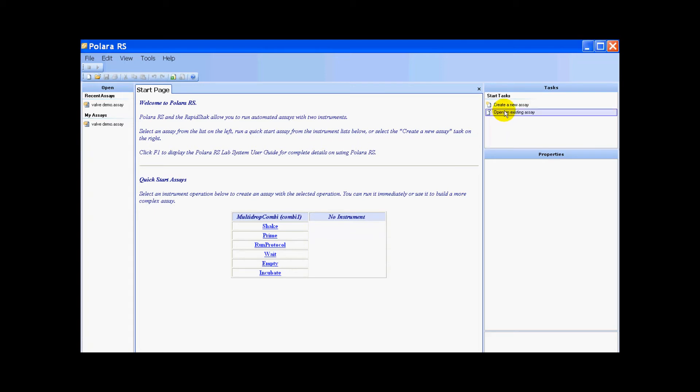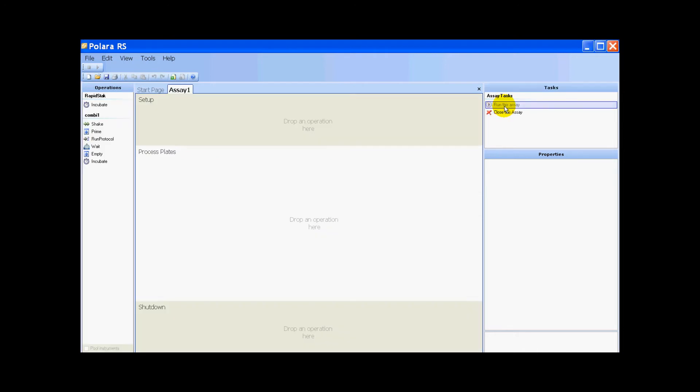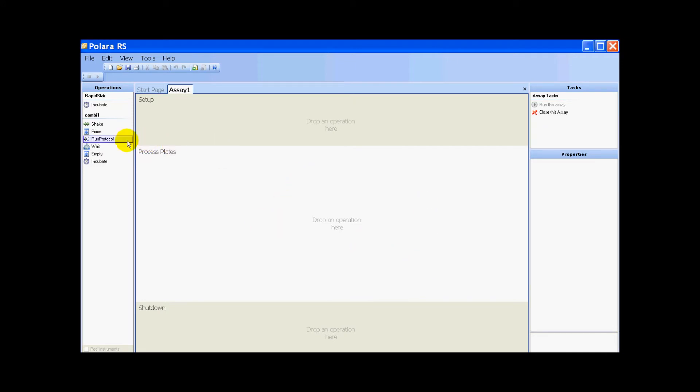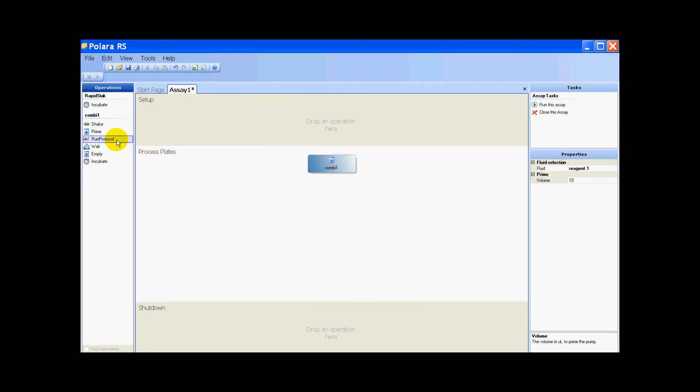Now all we have to do is select create a new assay under the tasks panel. This is the process editor for Polara RS. I need to drag and drop functionality from the combi under the operations panel into the process editor in the center. I'm just going to prime, run protocol, prime twice more, and then run a protocol.